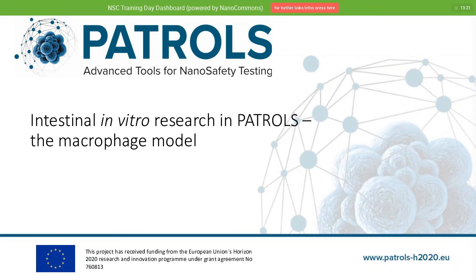So after having set the scene now, I would like to focus on a model that we are working with at the IUF, which has been developed, or actually advanced, in PATROLS. I call this the macrophage model, as opposed to the M-cell model, which was used by other partners within the project.